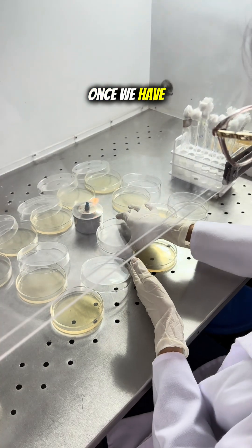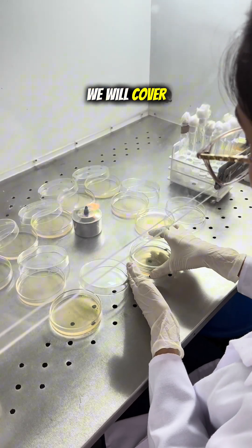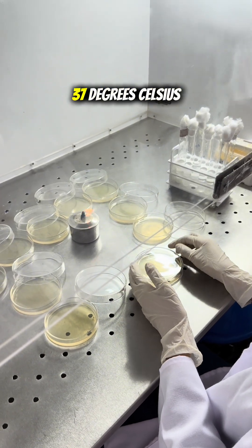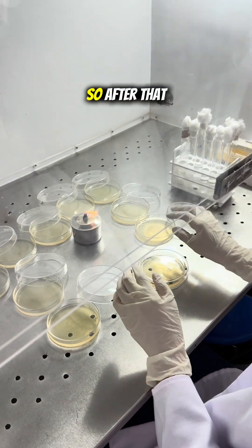Once we have spread our sample, we will cover the plate with the lid and put it in the bio-incubator at 37°C. We will keep it overnight, and in the morning we will check the growth and count the bacterial colonies using a bacterial colony counter to determine how much growth has occurred. That will be it for this experiment — thank you.